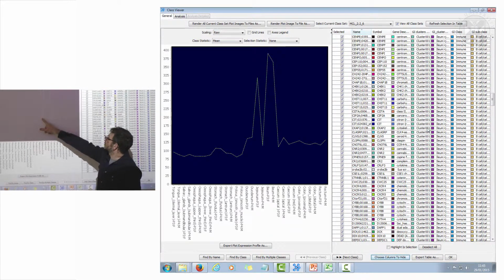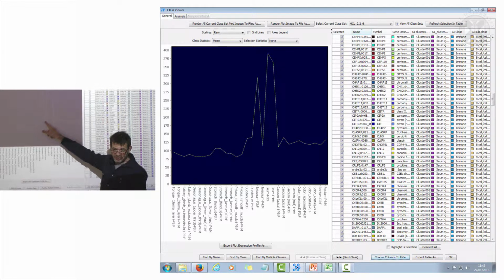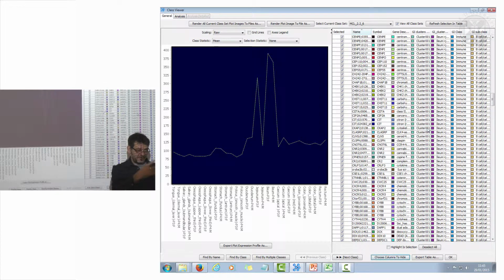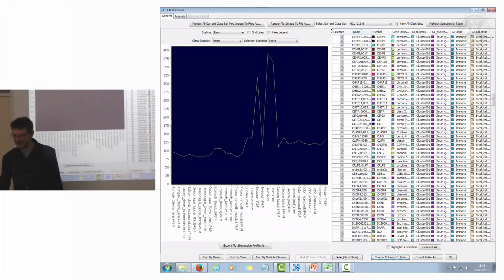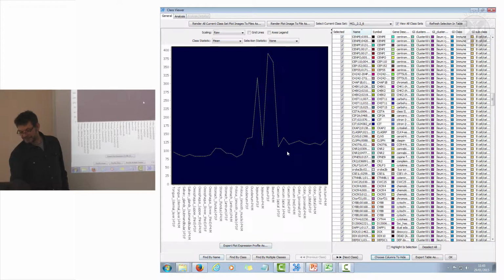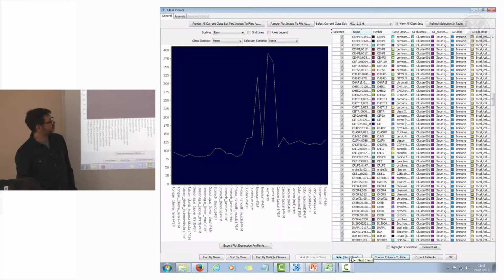We also noticed that only one of the jejunal samples is very strong. There's a lot of discrepancy between our 2 replicates here. Having selected this tissue, it's very hard to get 50 foot of pig gut and work out where you are. So it's possible that in the jejunal sample, or one of them, I collected ileum, or vice versa. Okay? So the replicates here are not great, but the overall signature is very nice.